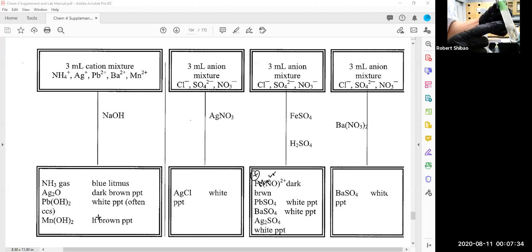That precipitate could be messing it up here, because the precipitate is acting like a plug and not letting the reaction occur. But definitely the sulfuric acid sunk to the bottom.